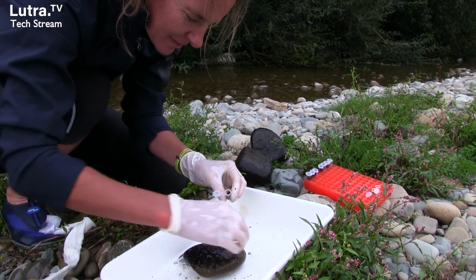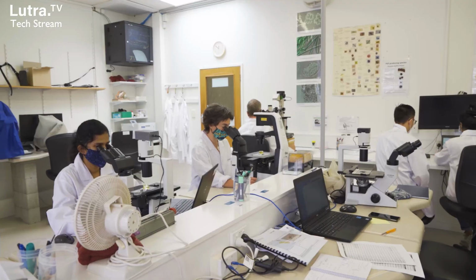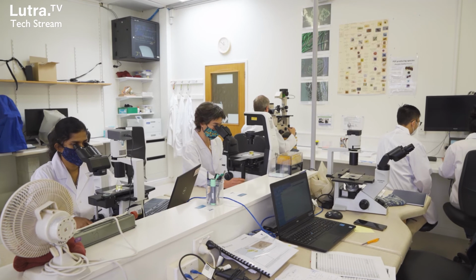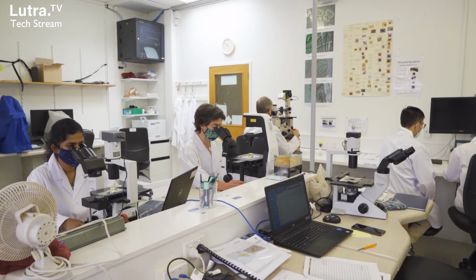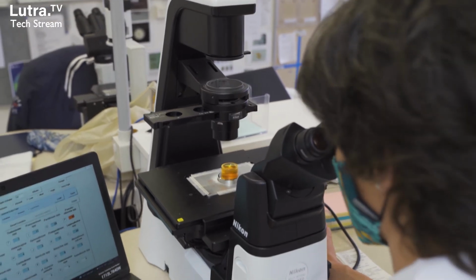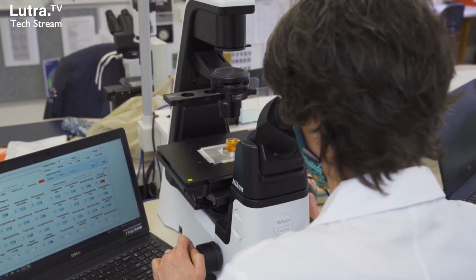And then if you send those scrapings to Cawthron and the team, they'll put those under a microscope, and they'll be able to look at the morphology and the size and go, yep, that's cyanobacteria. Nope, that is just some good old slime from the bottom of the river. All right. So then once you've identified cyanobacteria, you can go in and look at the genes and see if that's a greater risk. Yeah, exactly.